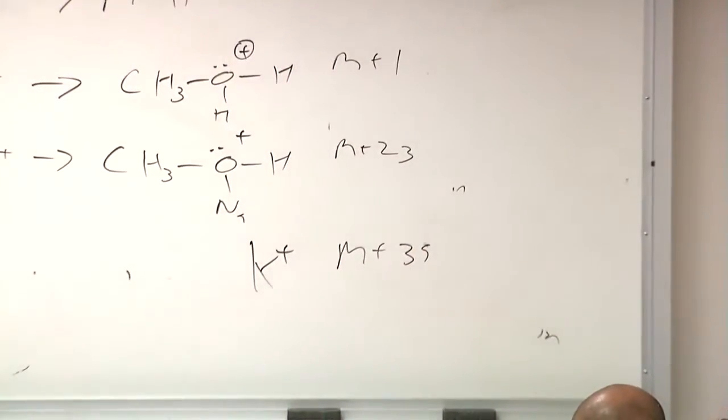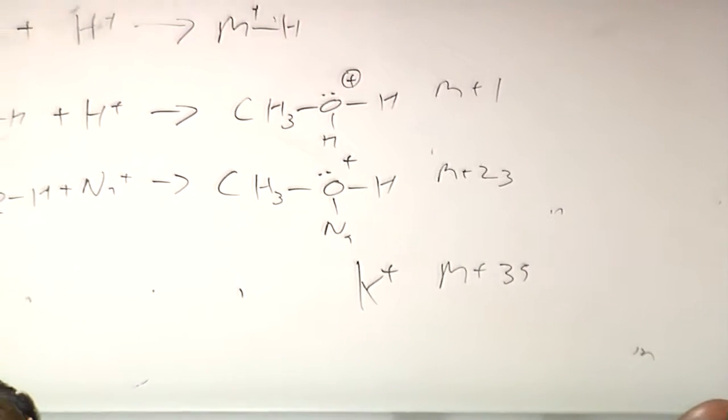And so what I want to do is show you an actual ESI mass spectrum of a molecule.